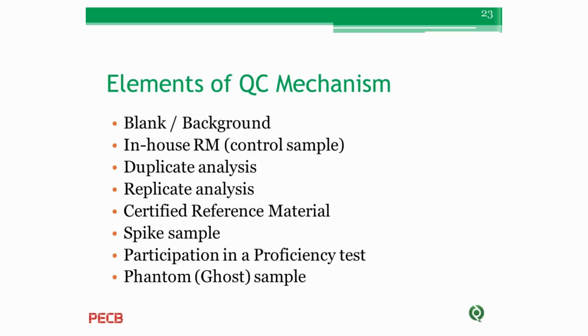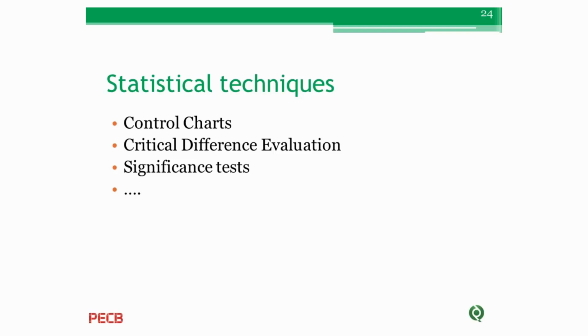In a phantom or ghost sample, the laboratory manager knows the true value of a sample. It might be reference material. But he keeps it confidential to himself and gives the sample to the laboratory analyst to see if they can measure the true value. Sometimes these mechanisms can be defined in the laboratory quality control program.